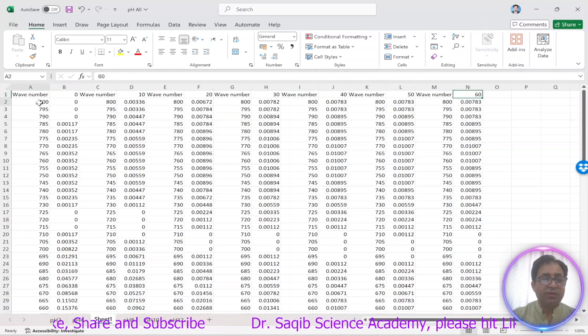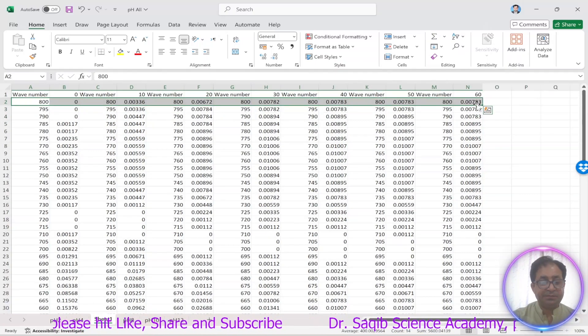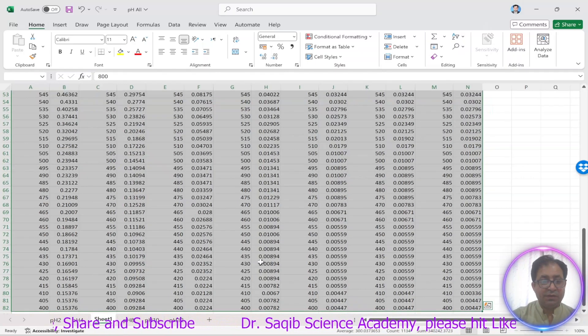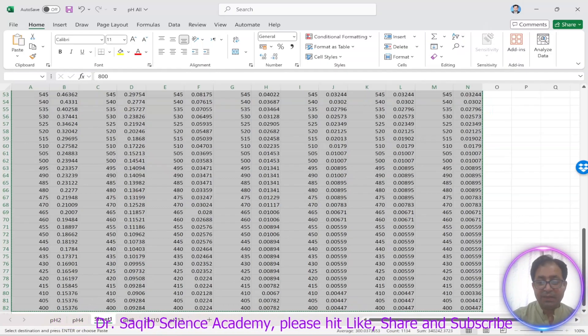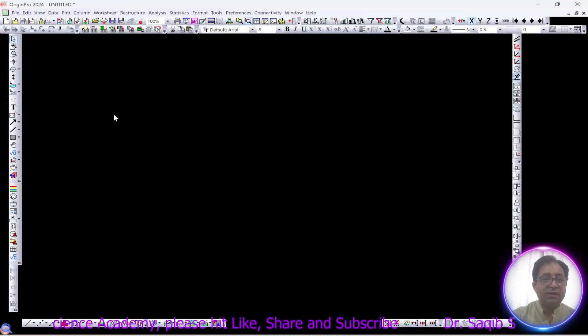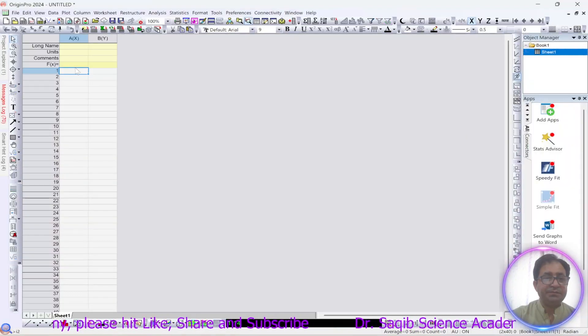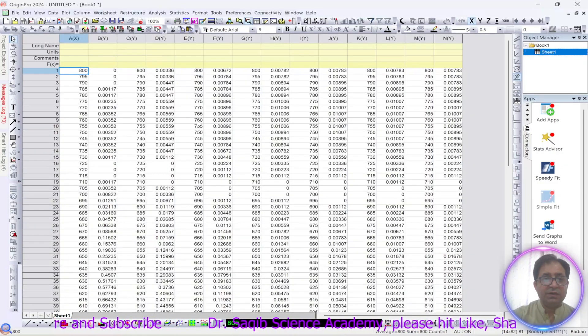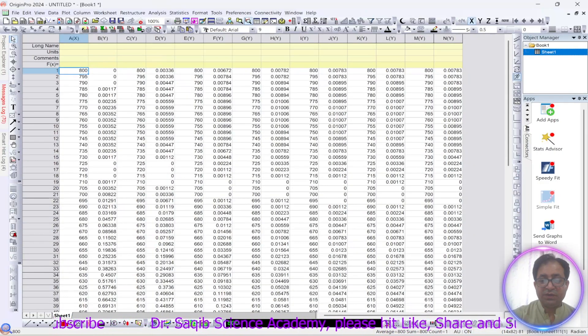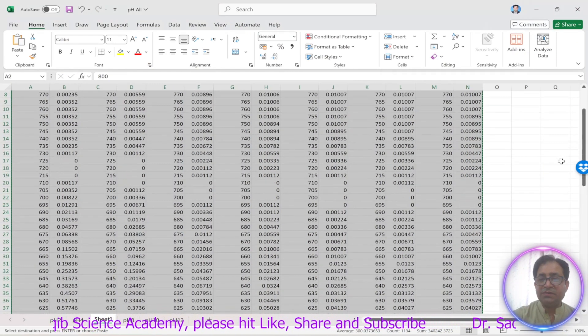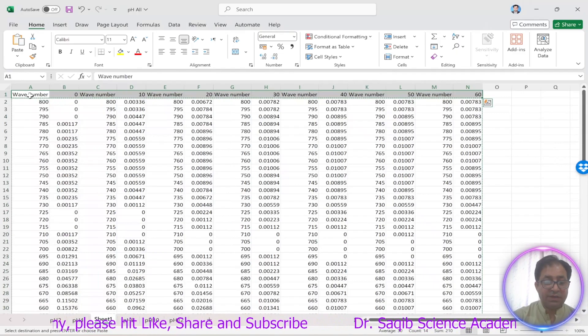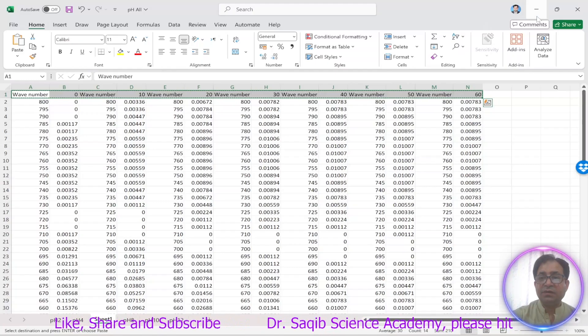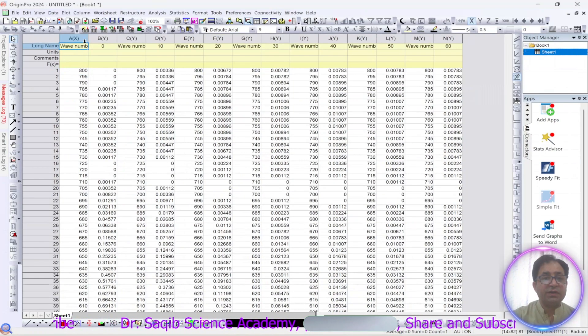Now what we will do, I will just copy this data with Ctrl+C and then I will put this data in my Origin software. This is my Origin software, then I will copy its name as well where is the wave number and where is the absorbance. So I will put this over here.